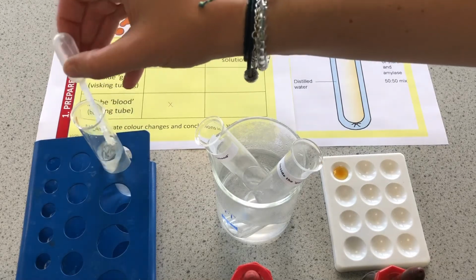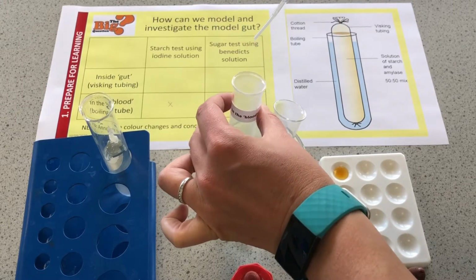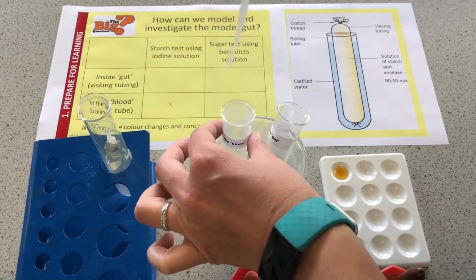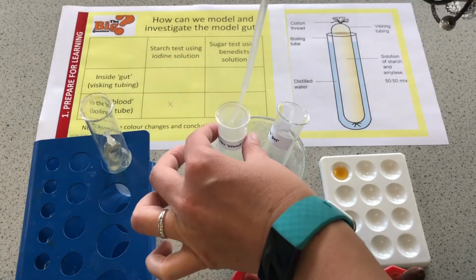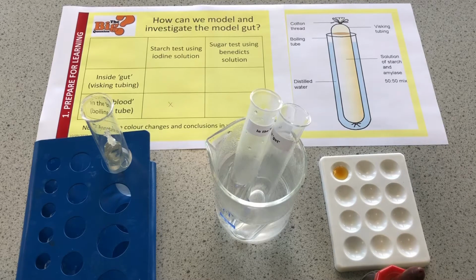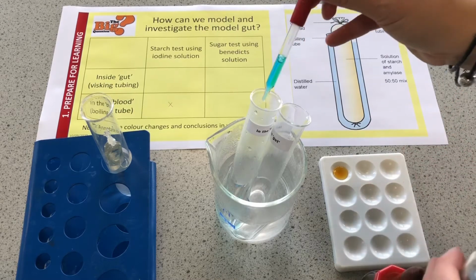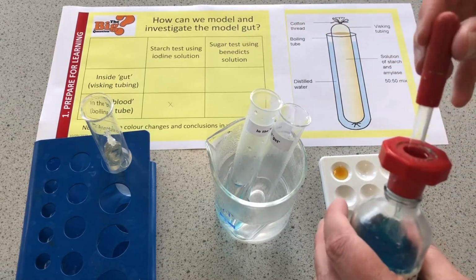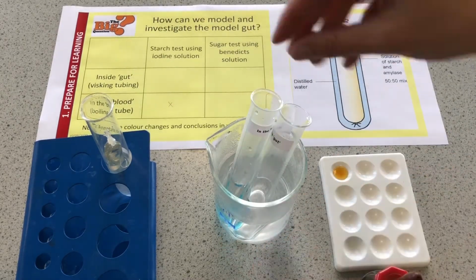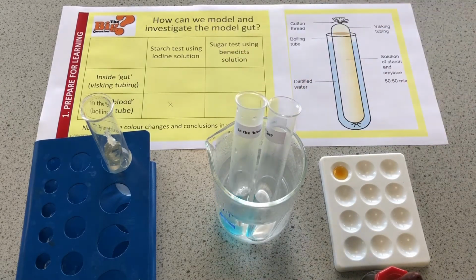Next thing I'm going to do is take some of that blood and I'm going to put it into this tube, which I've labelled in the blood, and this is in some hot water because I'm going to use the Benedict solution, which is heat activated, to see if there is sugar in the blood. Now this is going to take some time, so I will pause and come back to it. Add some Benedicts to there, and we'll see what colour change we get. So that was the Benedict solution. Okay, so it's in the blood, and we've got in there Benedict solution and some of the, in inverted commas, blood.